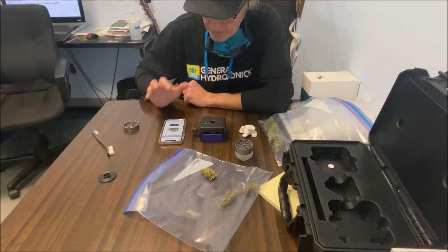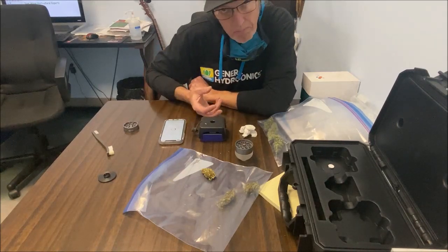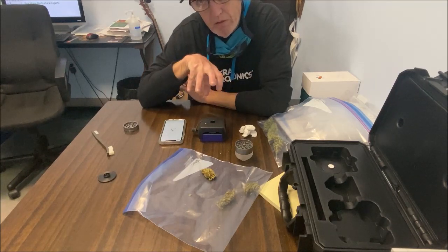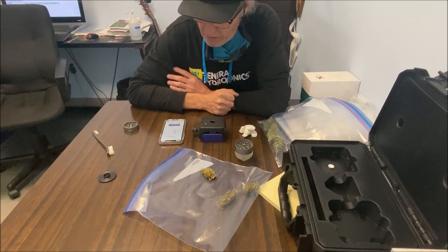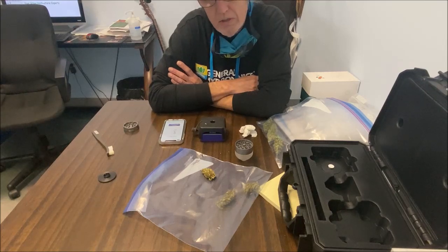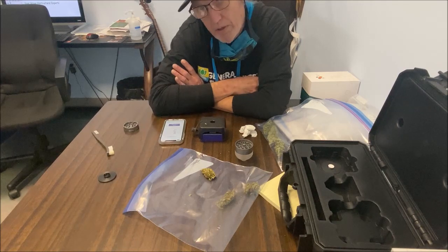So I press the measure button. It's scanning. What it's going to do is shoot up a beam of infrared light. And that beam is going to reflect off of the actual cannabis. And there goes the light. I just saw it in there. So it is analyzing, and here's what we come out with in this particular case. It's 6% THC and 9% CBD, which is really, really odd.